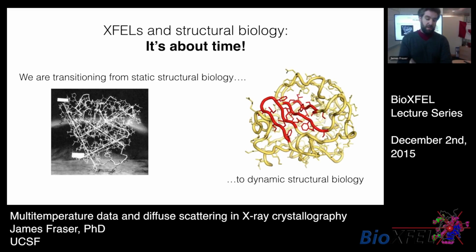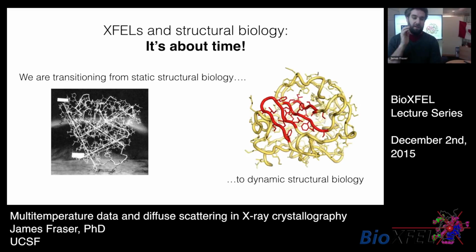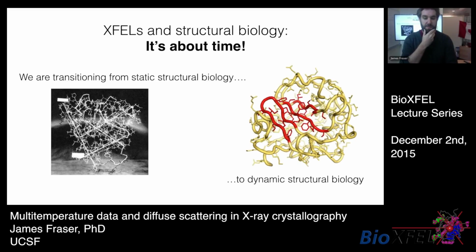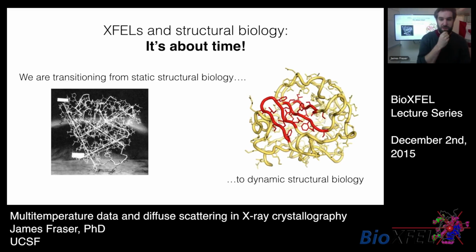And what I'm going to talk about today is really our transition point between that hopefully dynamic future where we really do use the time dimension and our current sort of static techniques where we're trying to infer aspects of the energy landscape from the time and space average of the X-ray crystallography experiment.